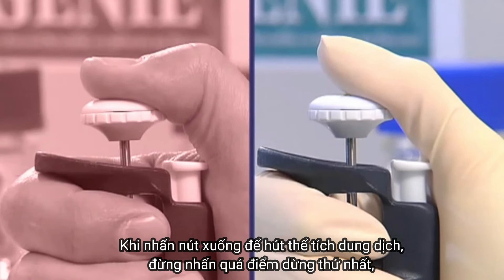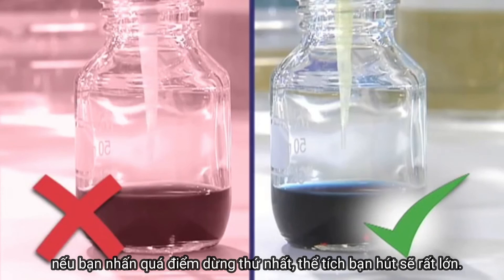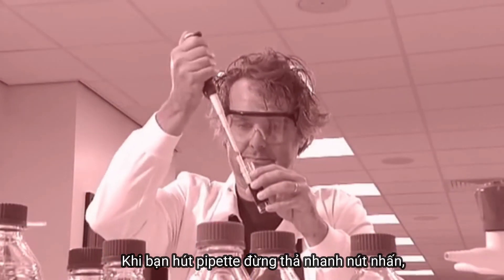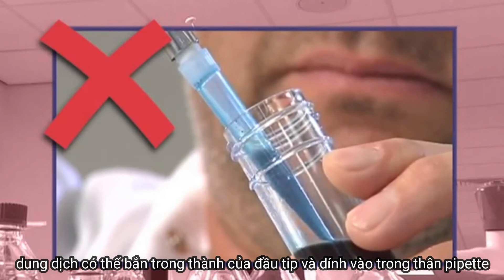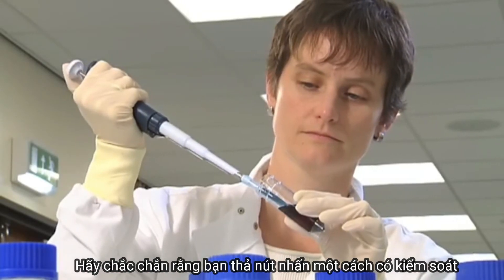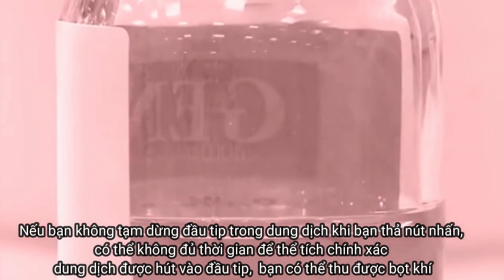When pushing down the push button to take up liquid, don't push past the first stop — if you do, the volume you take up will be too large. When taking up liquids, don't simply let go of the push button, as the liquid can be sprayed around the inside walls of the tip and up into the pipette body, causing inaccurate volume dispensing and pipette contamination. Make sure you release the push button in a controlled manner. If you don't pause after releasing the push button, there won't be enough time for the correct volume to be taken into the tip — air will be taken in instead.